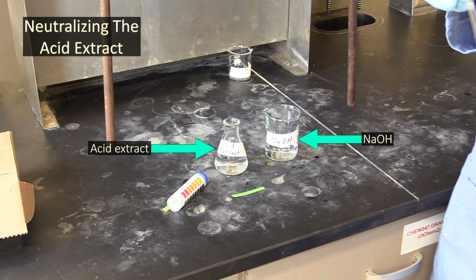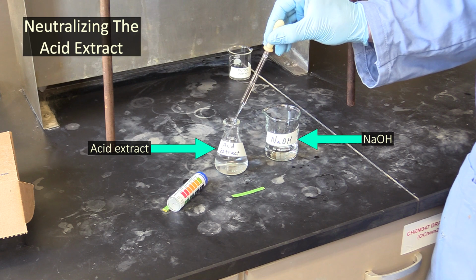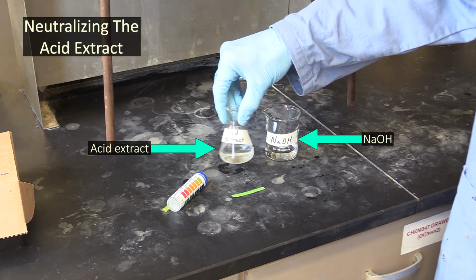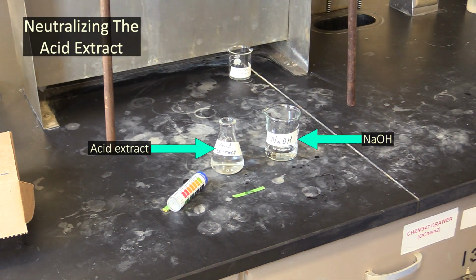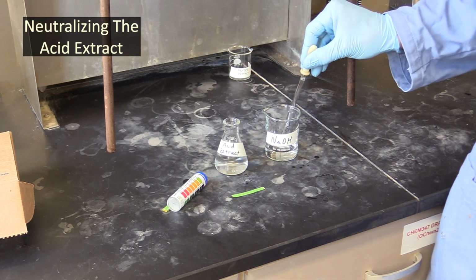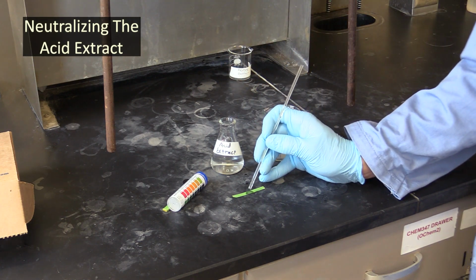While the ether in your organic extract volatilizes, you can neutralize your acid and base extracts. Neutralize your acid extract by adding about 5 milliliters of sodium hydroxide solution to it. Check the pH with litmus paper, and if it's not neutralized, add another 5 mL of hydroxide and check the pH again. Do this until its pH is neutral.